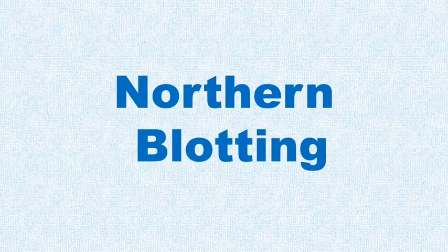I have already explained the term blotting in the previous video lecture. We also know that when we use the blotting technique for the detection of RNA, then it is known as northern blotting. The overall technique and the steps involved in northern blotting are almost similar to what we have studied in southern blotting. There are a few differences that we will discuss today. Let's begin.